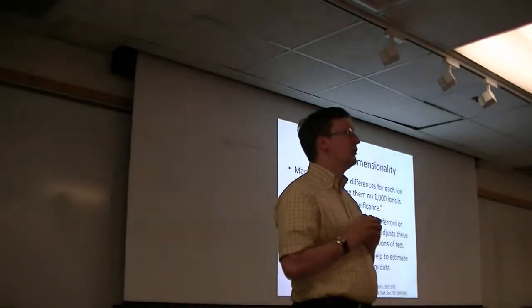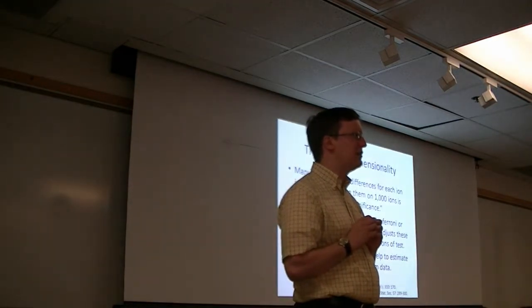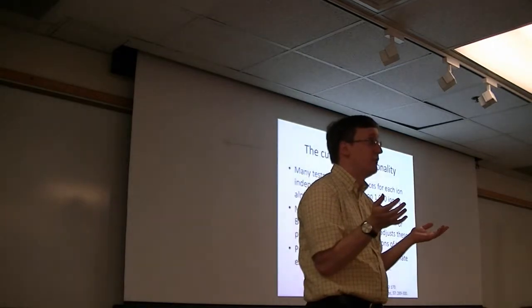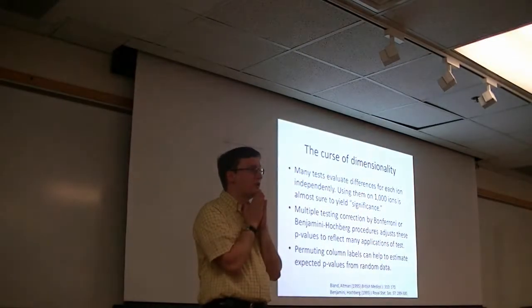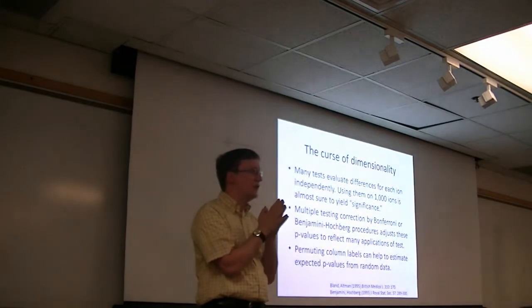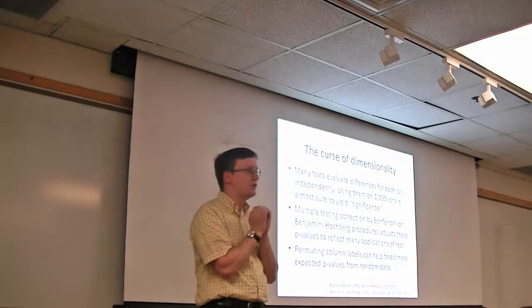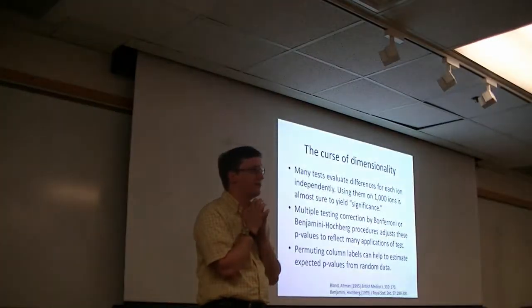Okay, so what distribution do I expect the p-values to follow if there's no difference? Should be mostly uniform, actually. We expect a uniform distribution of these values. So by random chance alone, how many of these 20 tests that I've produced should produce a significant p-value of below 0.05?